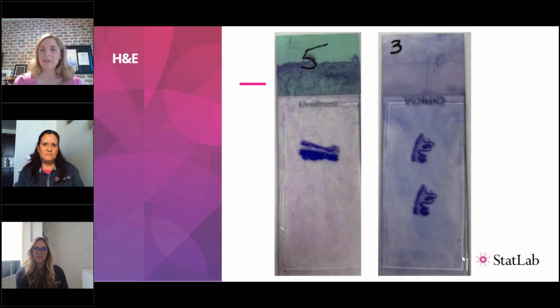So Rachel, have you ever seen something like that in your history in the lab? And if you encounter that, what are some common things to look for to maybe clean that up a little bit? Yeah, of course. I have seen it in the lab. One thing I did learn pretty early on is that tomo slides are pretty notorious for picking up a lot of extra background. And I know most labs choose not to use those for H&Es.